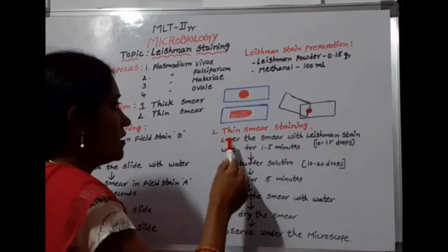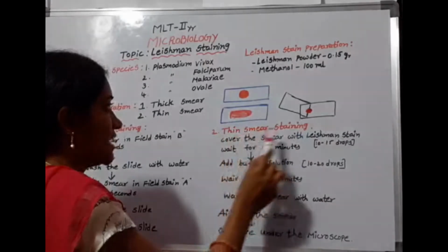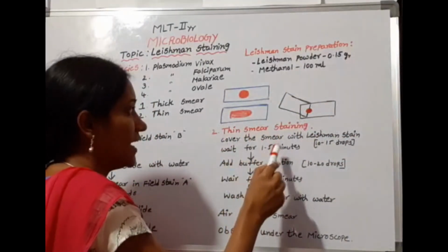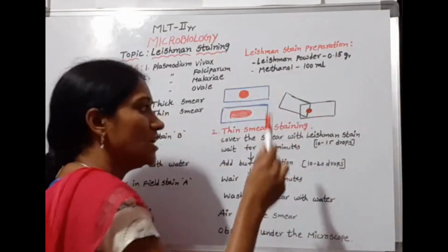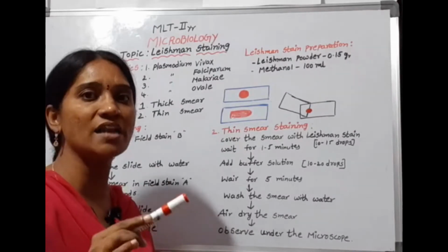For thin smear staining, we use Leishman stain. The smear area is totally covered with Leishman stain.